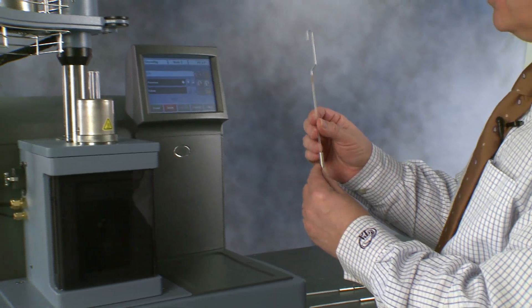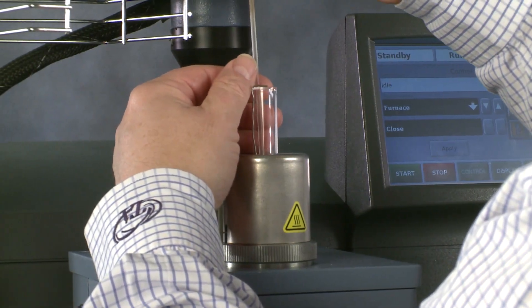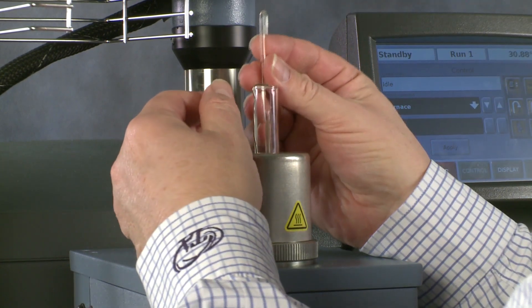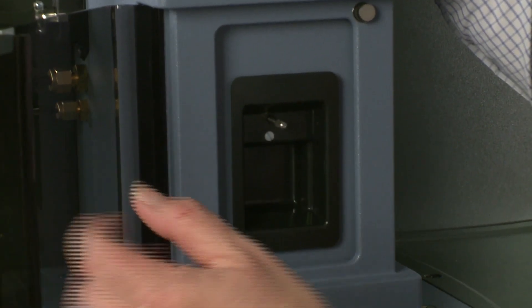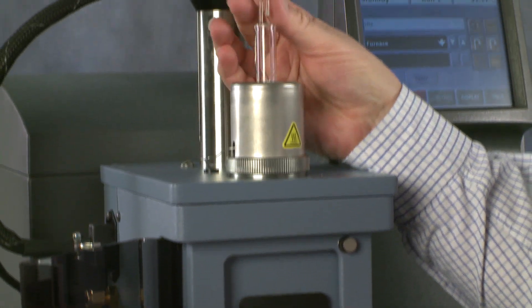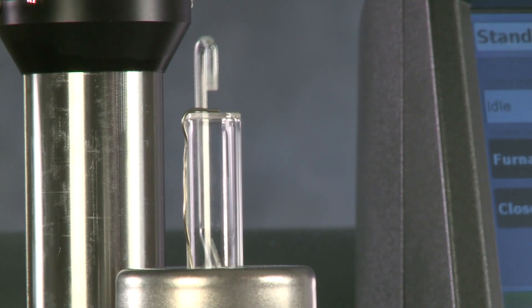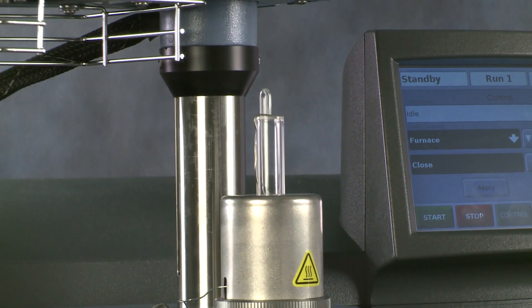We will take the probe and introduce it from behind into the sample stage. We will lower it slowly inside the mechanical part of the instrument. When it's close to the end, we will open the weight tray, lock it, and let the probe go down until it sits completely inside the mechanical part. We can align it and then turn the knob to lock it in place. Carefully, we will put it down on the sample stage, close the weight tray, and it's ready to calibrate.